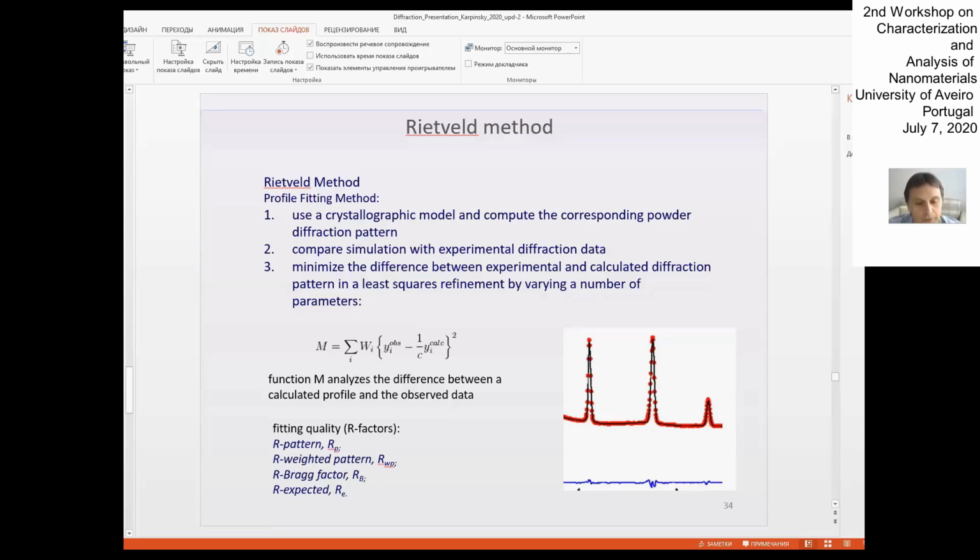The idea is to refine, not to estimate or clarify, just to refine. It means we already know the model. First, from basic theoretical crystallographic theory, you construct this initial model, and then you refine it against your experimental data. Yes, you can say it like this.